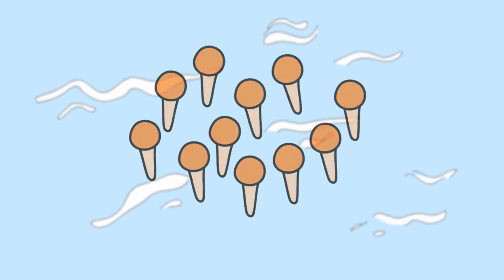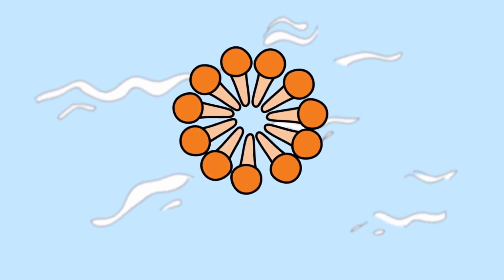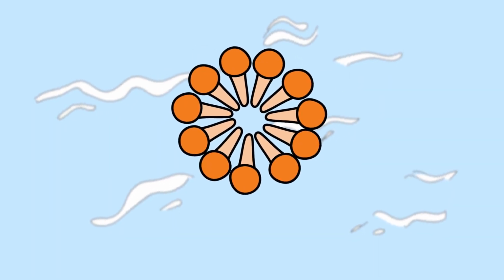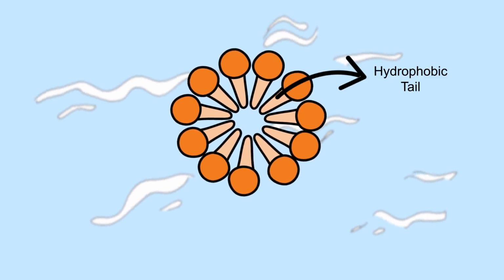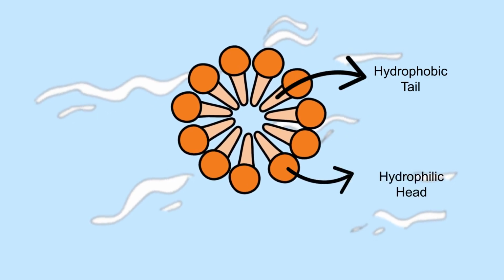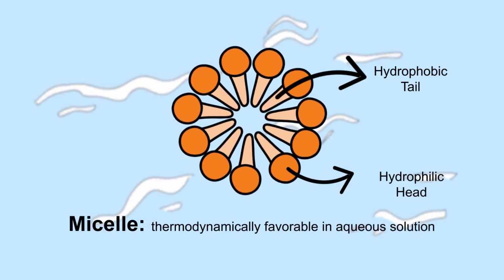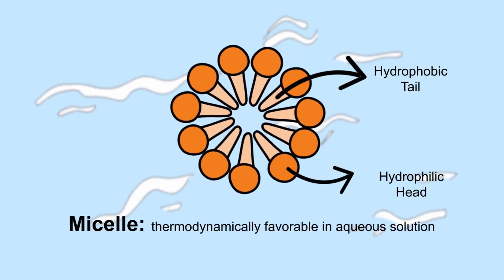When SDS is present in aqueous solution at a high enough concentration, spherical structures will start to form so that the hydrophobic tails are buried on the inside, and the charged hydrophilic head can interact with the water molecules. We call these spherical structures micelles, which are thermodynamically favorable in aqueous solutions.